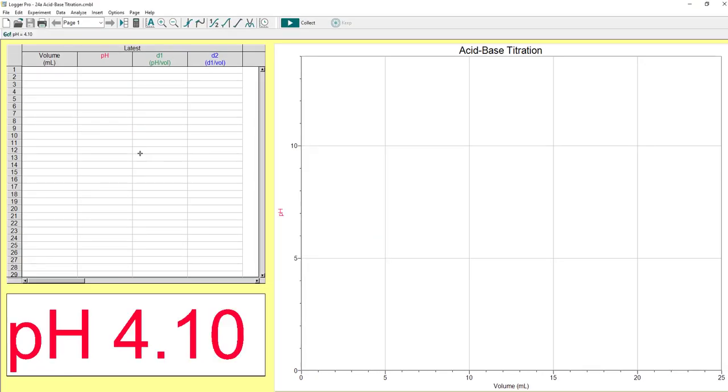I just want to point out right now my pH probe is sitting in a buffer solution. So we're not going to see any pH change unlike your solution. You're going to add a 1/2 ml increments of sodium hydroxide to titrate the weak acid. So to start off, you're going to record the pH of the diprotic acid solution without any sodium hydroxide added.